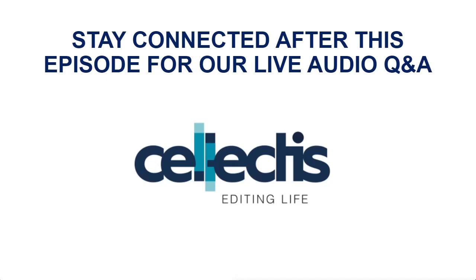And I have a series of questions here that come to either electroporation or TALEN knockout efficiency. Maybe to start with, is there one aspect you're pointing to where we make the most improvements that will further our gene editing efficiency, either in electroporation or the way we edit a genome with TALEN? And also the question on multiplex editing. Is there a threshold where we would say this is too many steps in one go, so to speak, to stay under a threshold of translocation? I know this is a series of questions, but between Raleigh and Paris, feel free to take those questions.